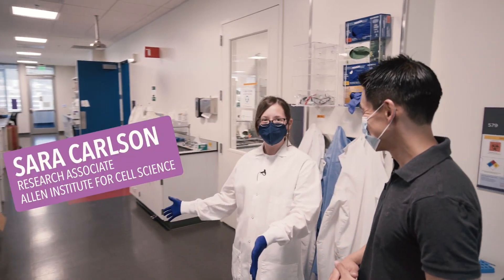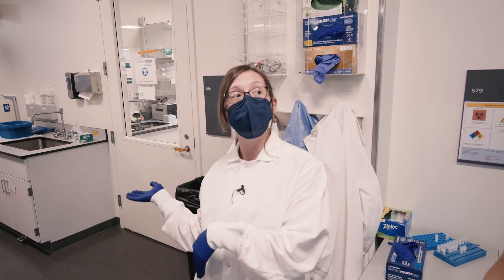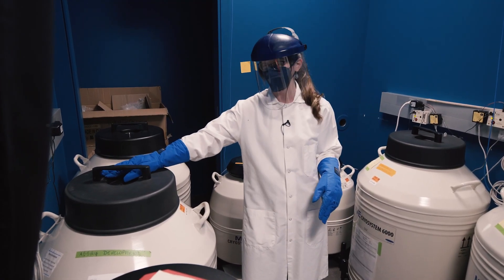Welcome to one of our cell science labs. Today we're going to thaw some cells. We're going to go into the liquid nitrogen tank, which stores liquid nitrogen. Basically it has racks in it that will store our cells.